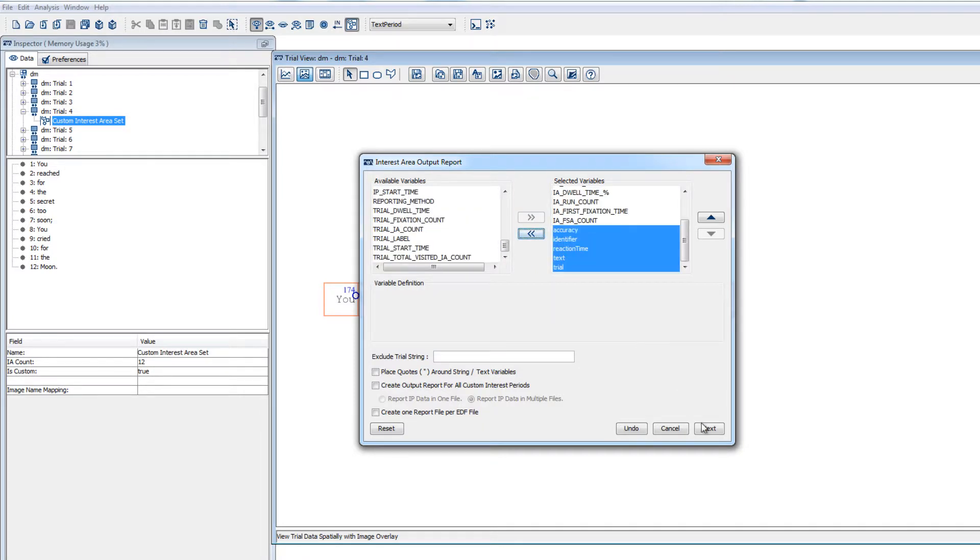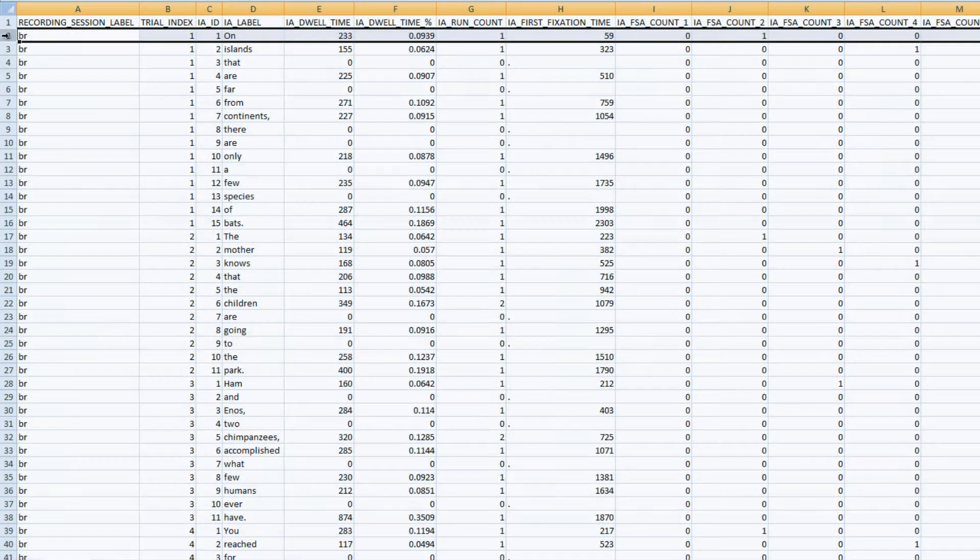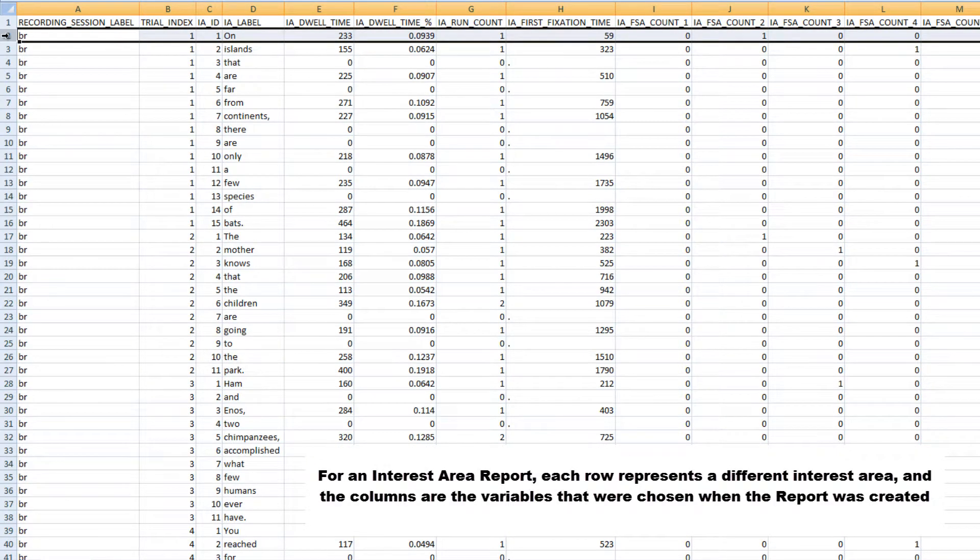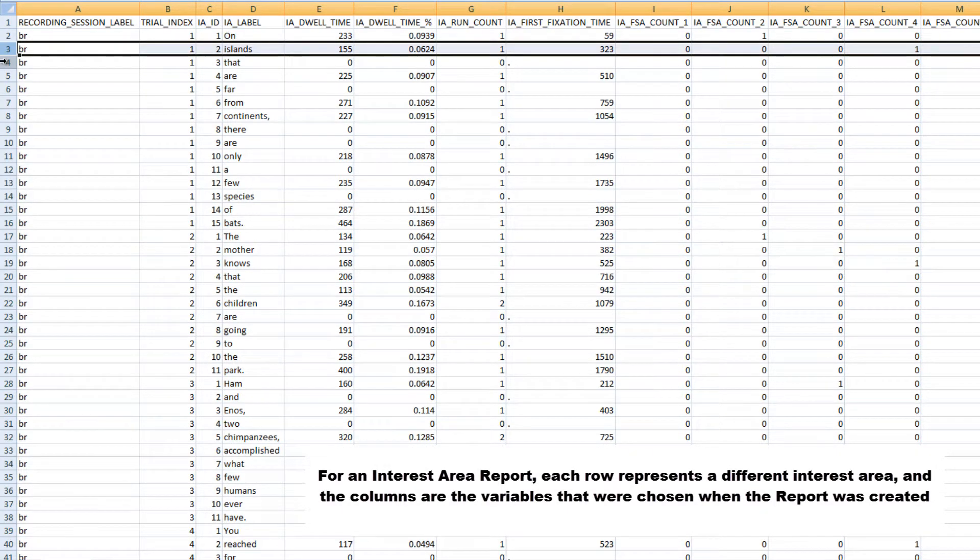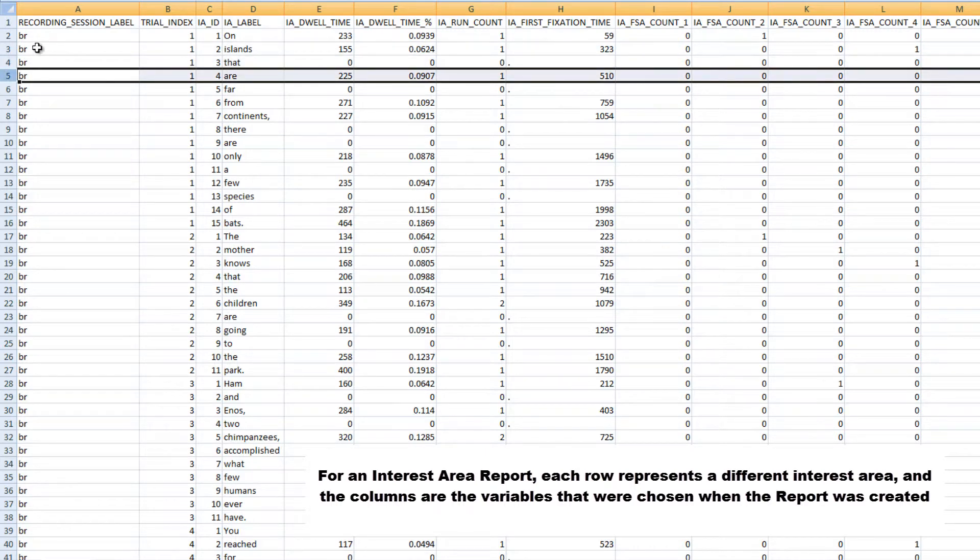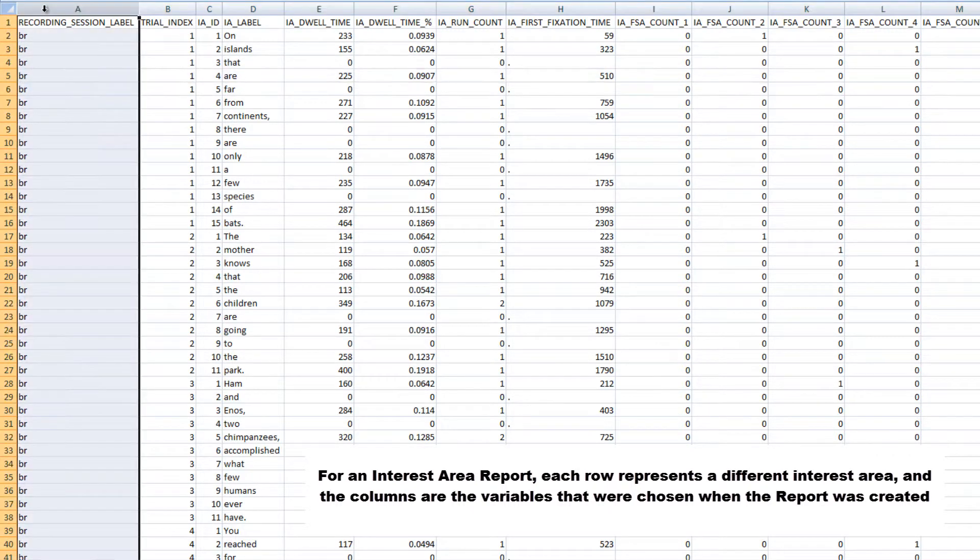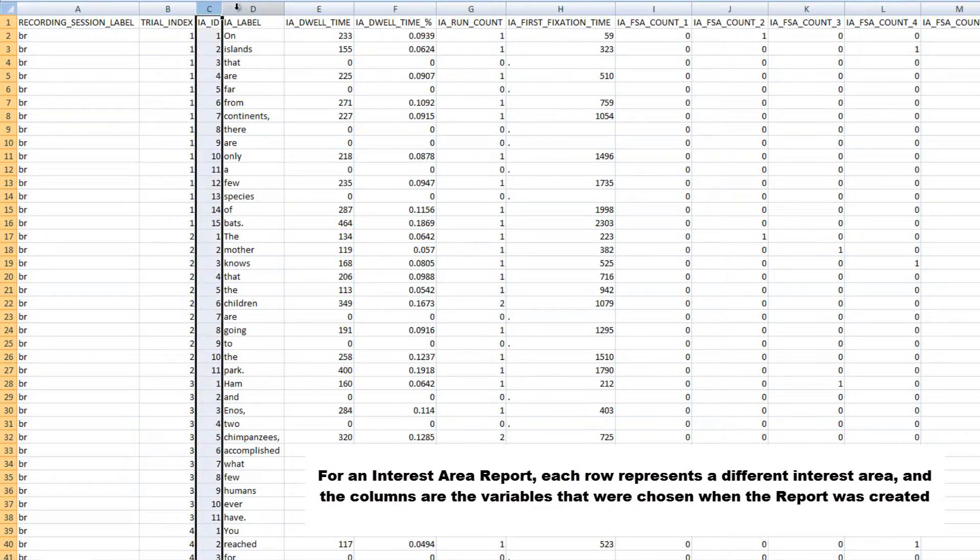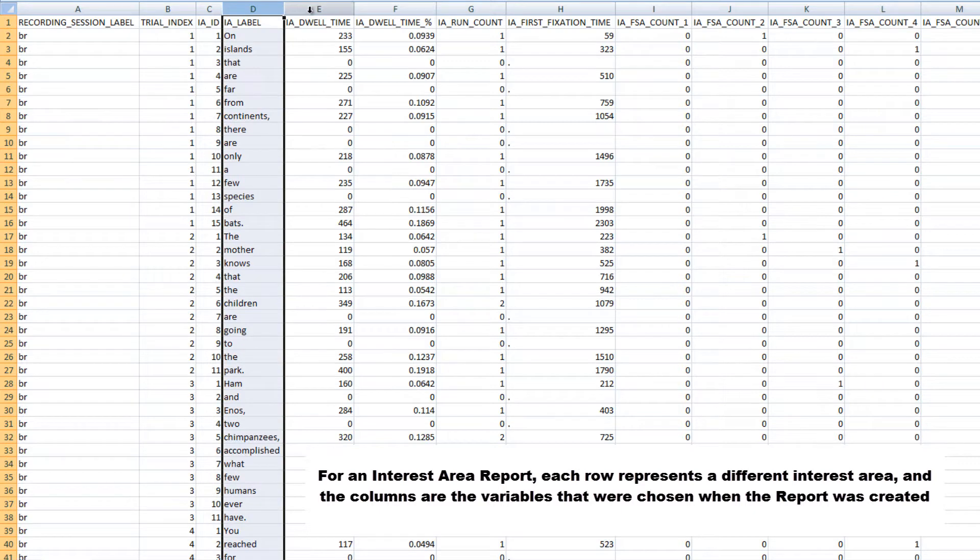We can take a look at this report in Excel too. We can see that each row corresponds to a different interest area, and we have all the variables that were chosen when we created the report included as columns.